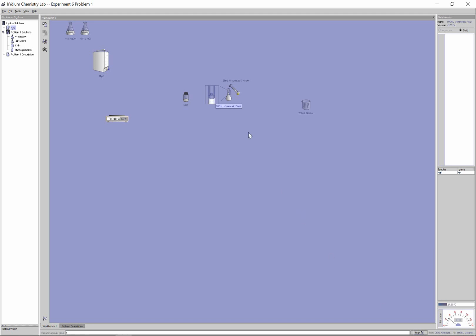When you get up really close to the top, the best technique here is actually to take one of those eyedropper pipettes, squeeze it in, and you can actually drop it in sort of like a fraction of a mil at a time. So those eyedropper pipettes here, maybe I drop it in 0.5 at a time here. I want to be really, really precise so that, maybe I even want to do 0.1 for the remaining of it here. I want to make sure it hits this mark because this volumetric flask is really well calibrated.